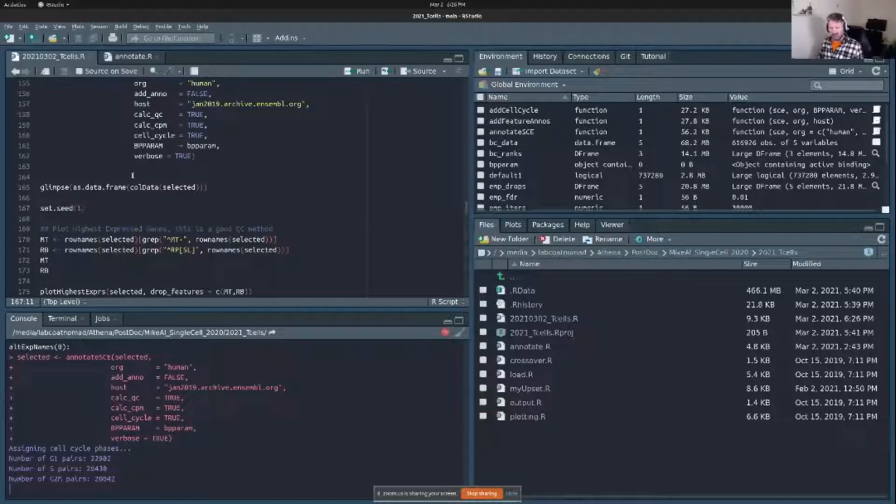And I'm not going to go through every package I run and read all the code of every open source project. So for reproducibility, anytime I'm at a step where I want that reproducibility, I reset my seed. I don't know if that's best practices. I don't know if that's stupid and redundant. It's what I do. Take it as you will. I'll change this to something a little more interesting like the date. And we'll just let that finish running.